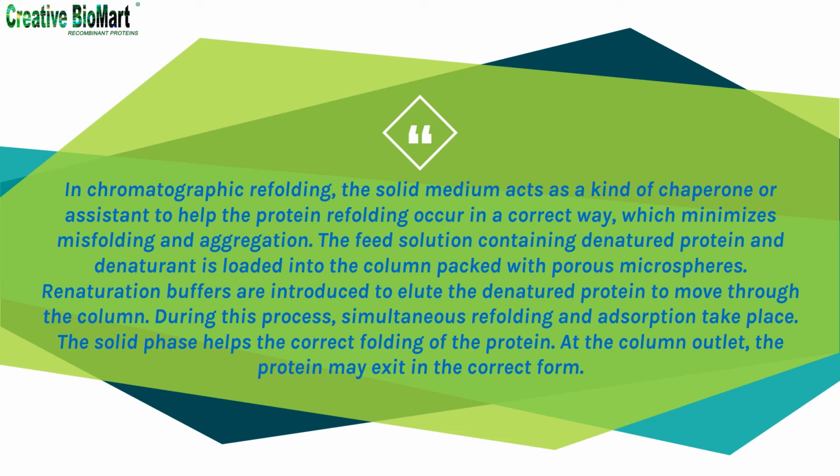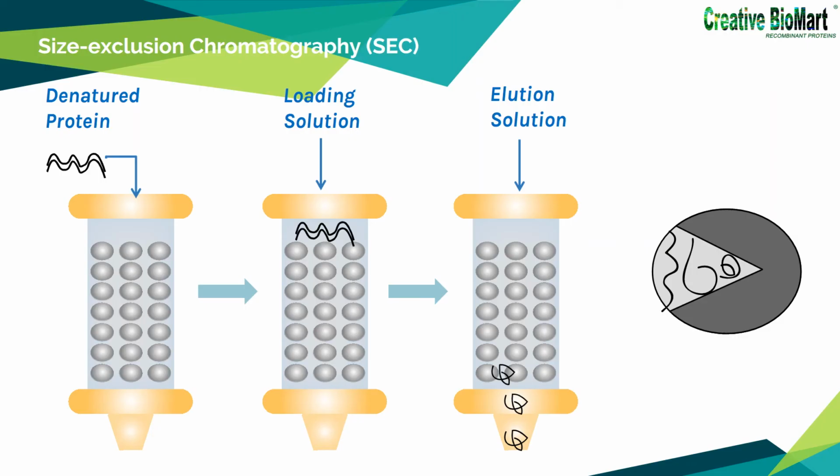Chromatographic refolding is a very complicated process. It is presently difficult to describe the mechanism of chromatographic refolding, because information is very limited. 1. Size exclusion chromatography. The pores of the SEC media have selectivity regarding the size and shape of the proteins. Unfolded protein has a stretched, long shape that is difficult to insert into pores. The correctly formed product, being compact in shape and size, can access the depths of the pores, and is therefore separated from unfolded and partially folded ones.